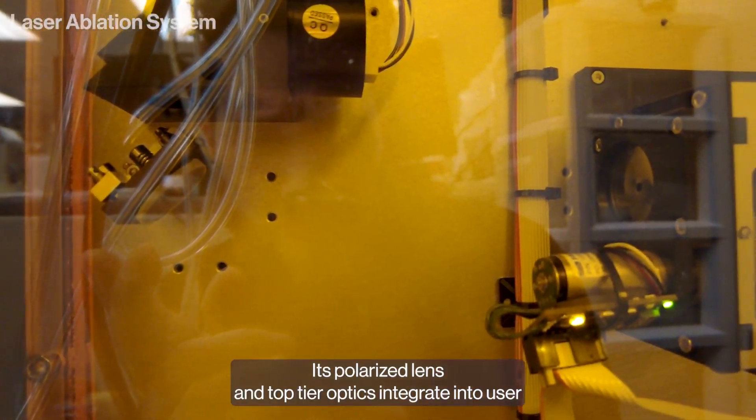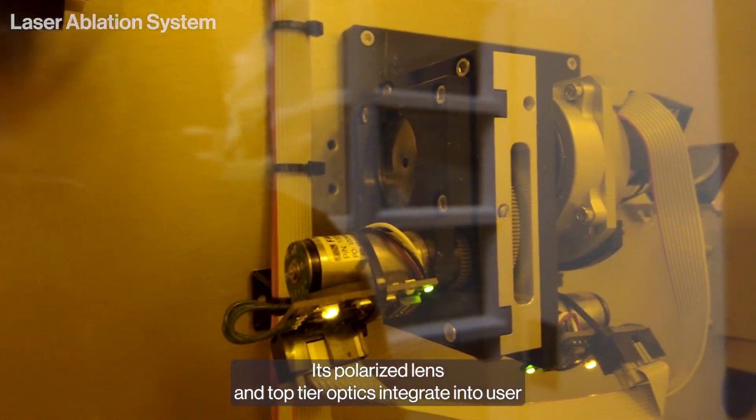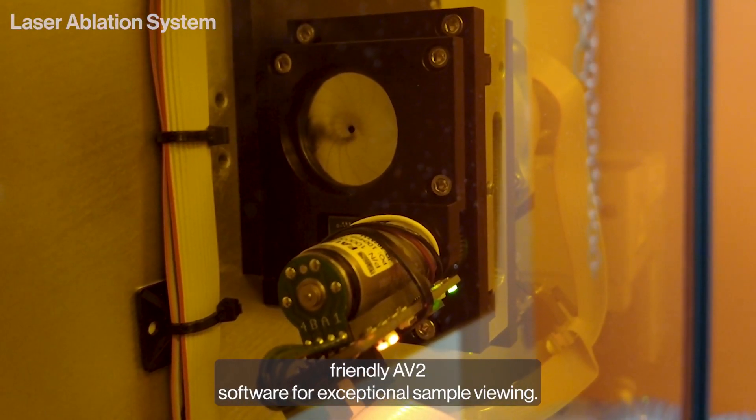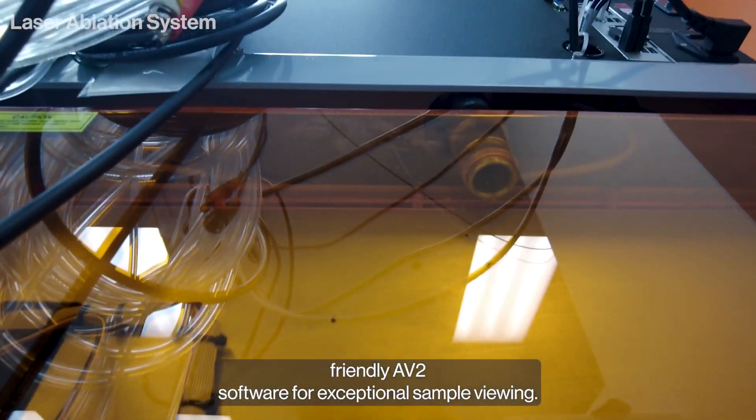Its polarized lens and top-tier optics integrate into user-friendly AV2 software for exceptional sample viewing.